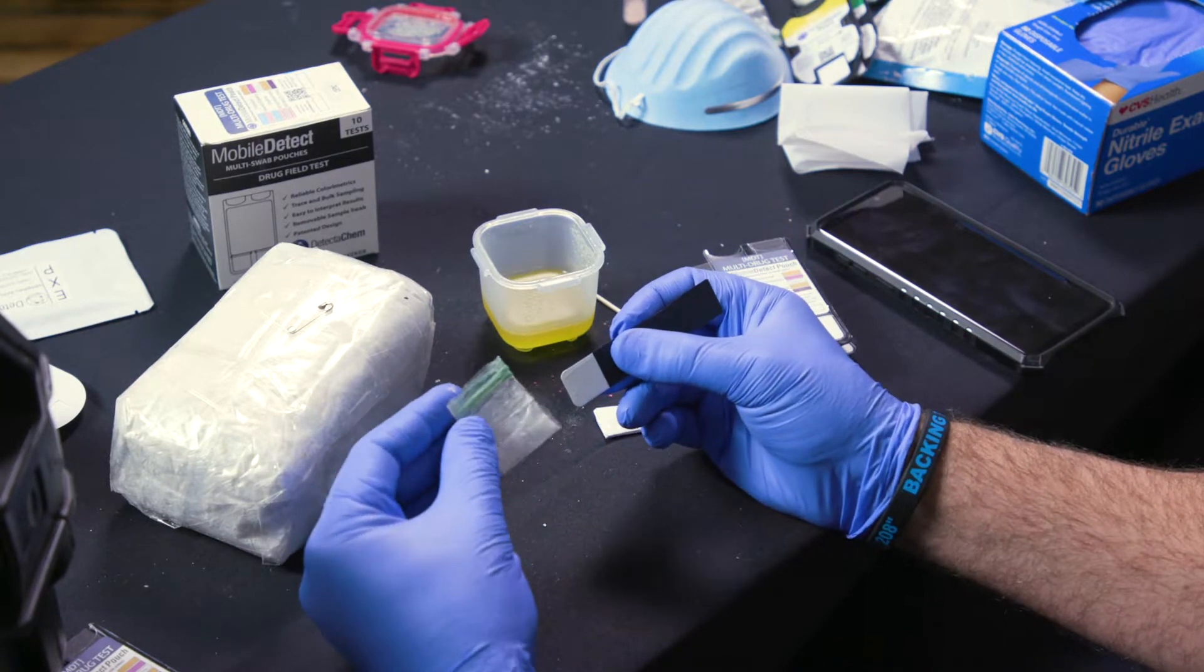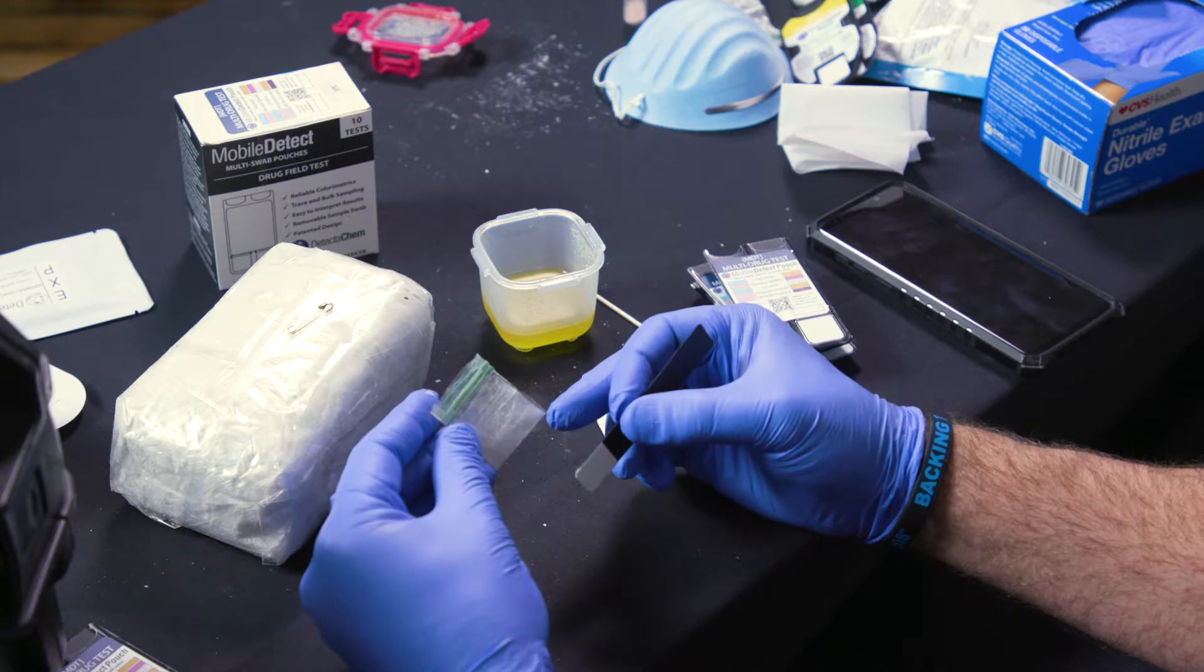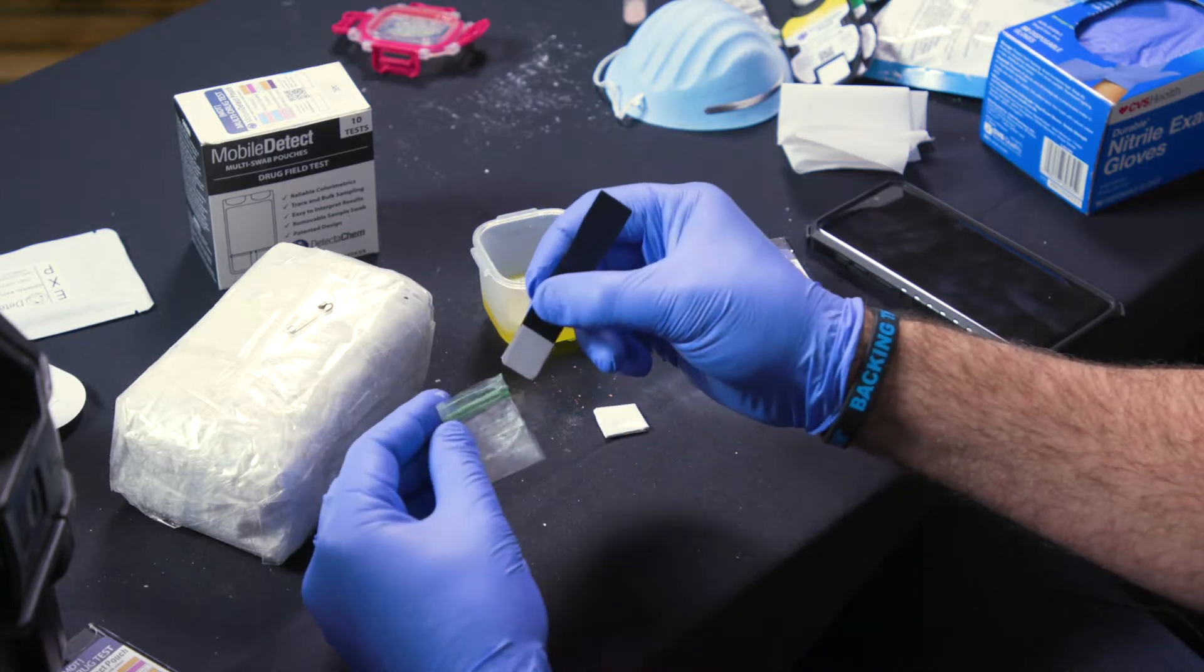The same with trash pulls if you've found something that doesn't look like there's any residue in there whatsoever, that'd be the same type of application.